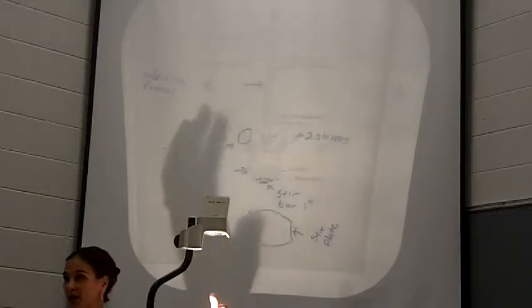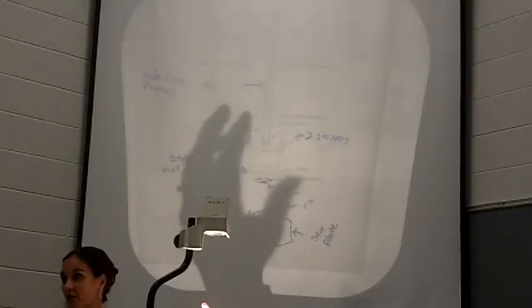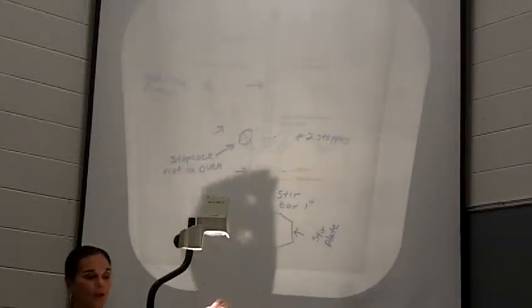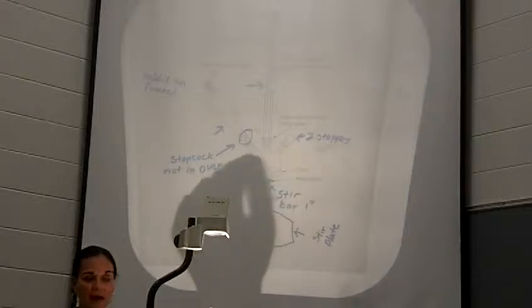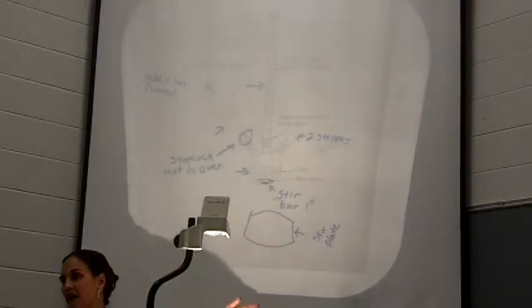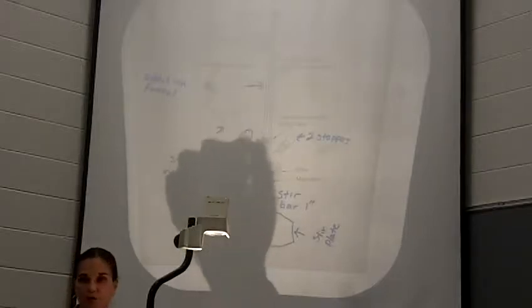Then probably at this point, your lab prof's going to check, okay? So don't add any of this yet. We're going to check it. We will add some iodine, so I'll talk to you here in a minute about the iodine. We'll add some iodine to this, and then we'll add a portion. It says about 5 mils in your lab manual. We'll add a portion of this to your reaction, okay?